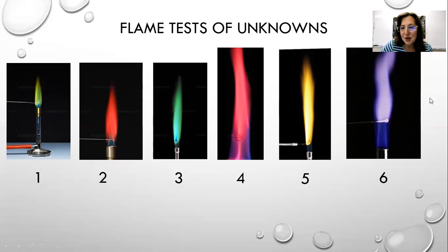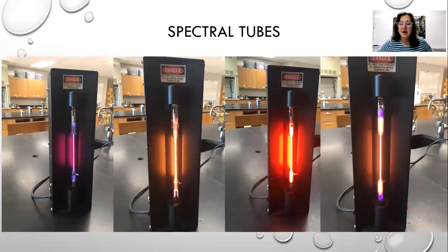So probably pretty obvious there what those unknown elements are, but you want to go ahead and write those in your manual. If ever we do come together, I would love for you to see these flames in person. They're really pretty.